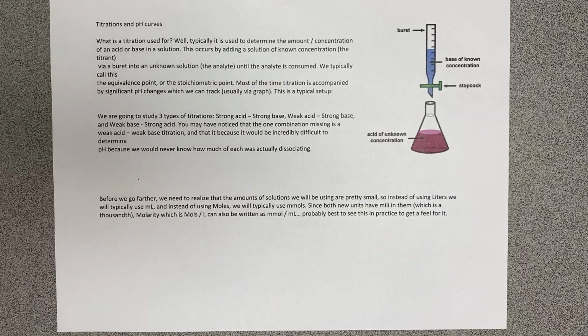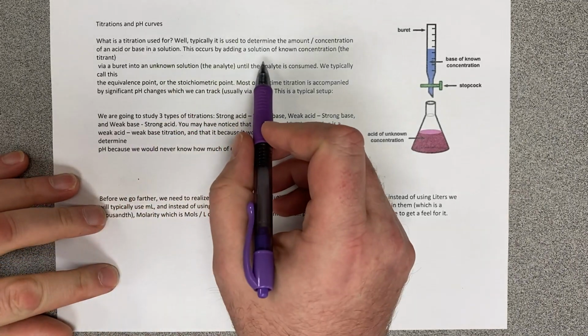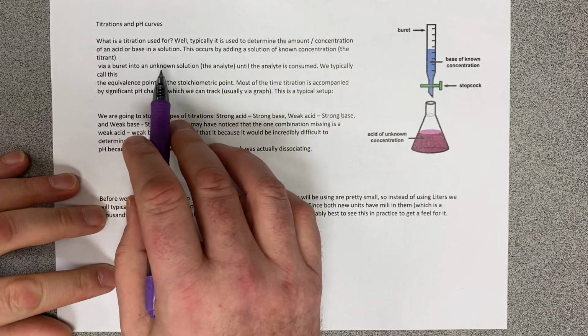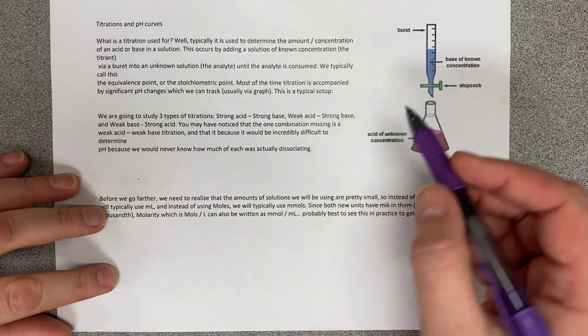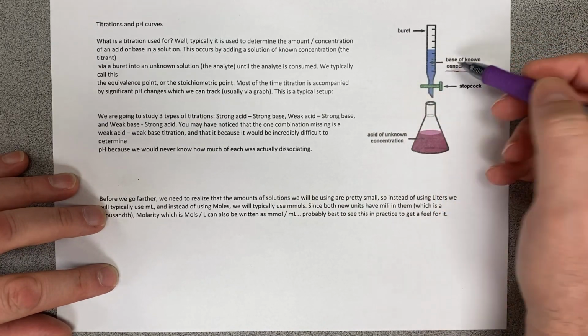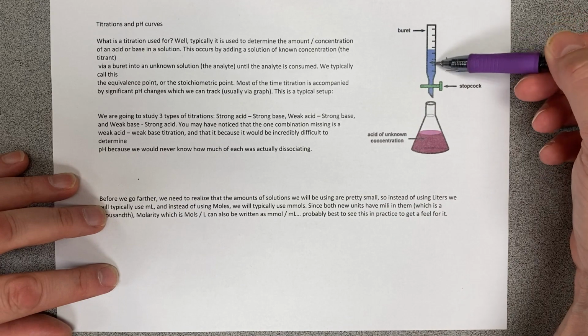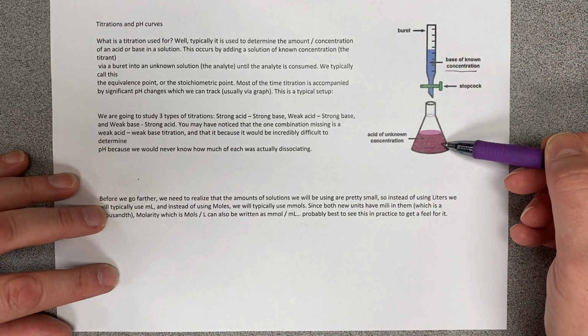All right, so what we're going to talk about today are titrations. Essentially, we need to know what a titration is for, and what it's for is to determine the amount of an acid or base in solution that we don't know the concentration of. The way we do that is by adding in something that we know a concentration of. So if you see over here, this would be the concentration that we know, and we pour it into the thing down below here that we don't know about.